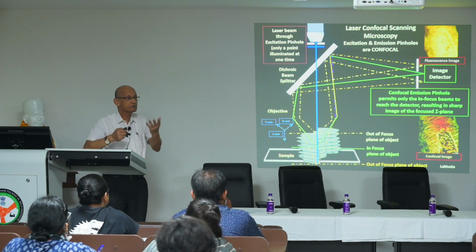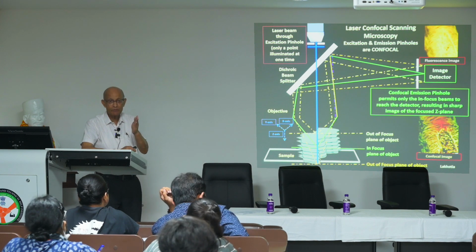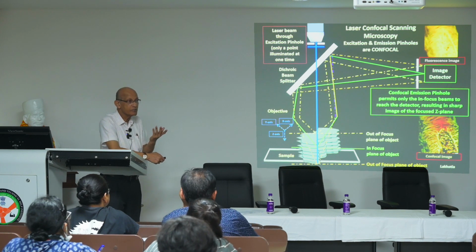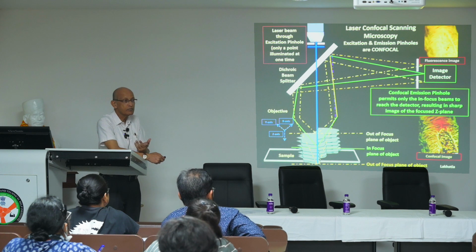When the next image comes, our brain has lost the continuity of the previous image. And therefore, if we say, all right, I'll keep on imaging each point separately and look through the eyes, we don't see anything, because all that we can see is just one point. And that point is so small that our eyes will not actually be able to detect it.